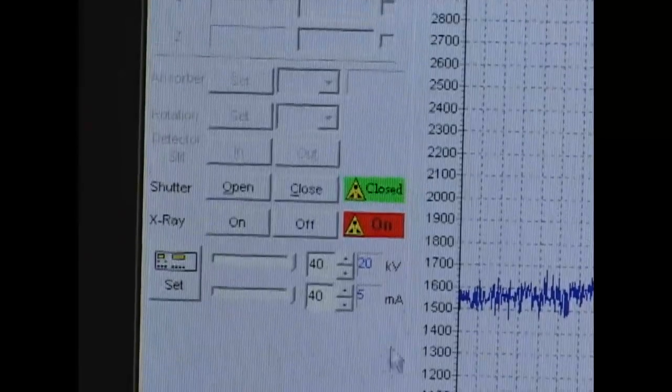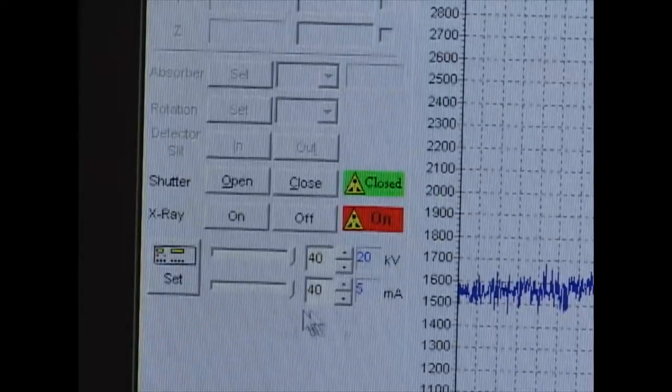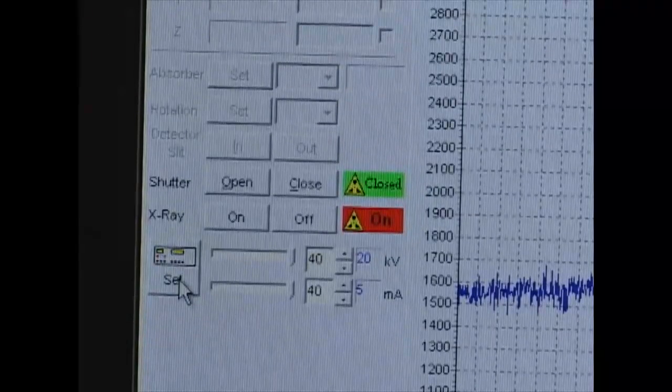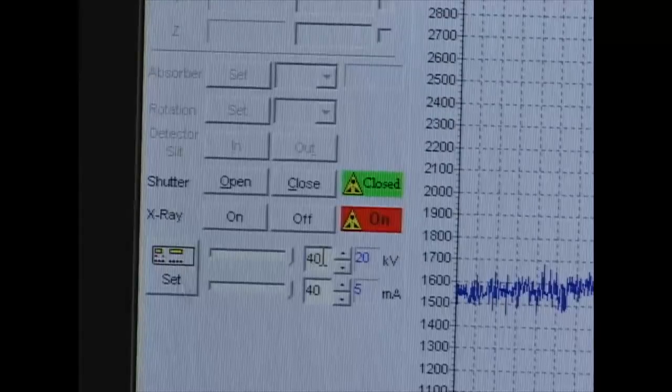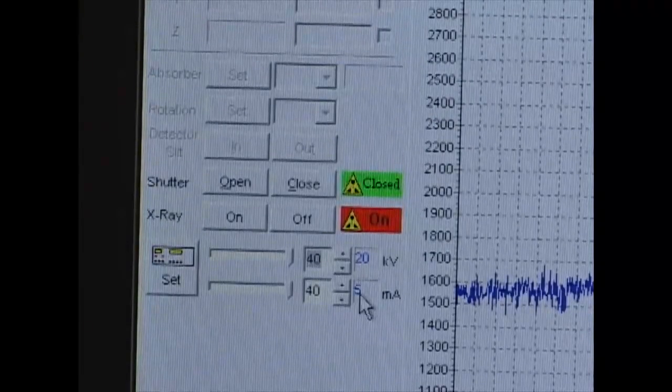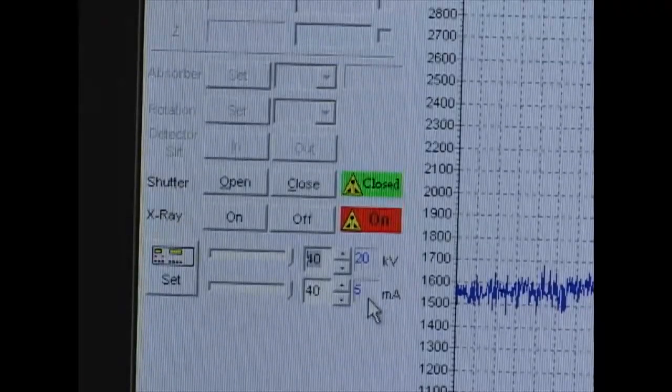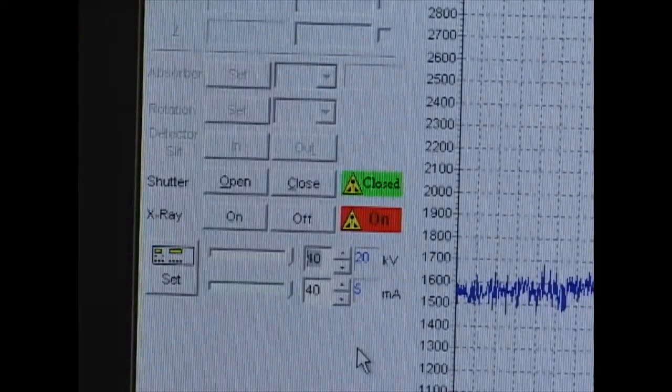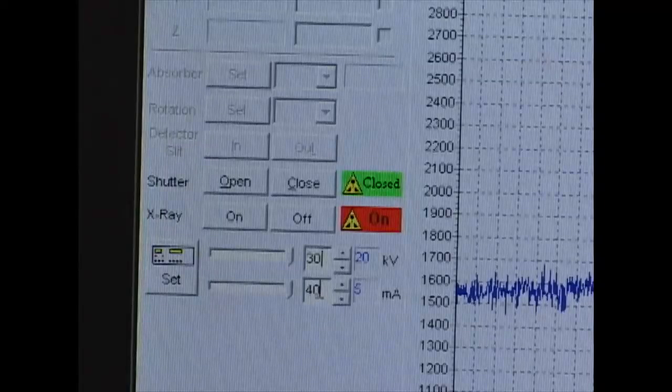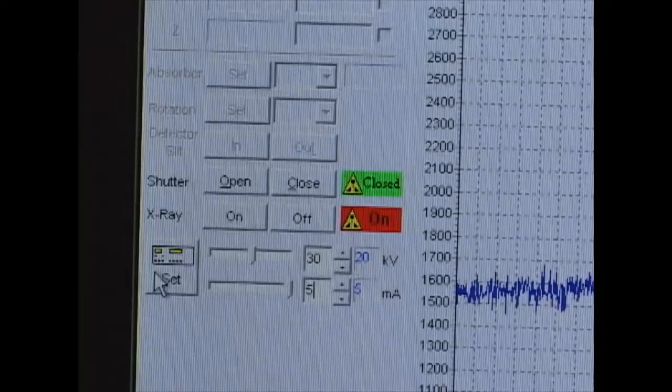When you do want to begin, you want to ramp your power up to 40 and 40 kilovolts. It's important not to just hit set right here. You want to ramp it up slowly. So what you want to do is input the values first. And so we're going to ramp the kilovolts up by 10 kilovolts first, leaving the current the same. And then we're going to ramp up the current. So we're going to put in 30 kilovolts and 5 milliamps. And then press the set button.